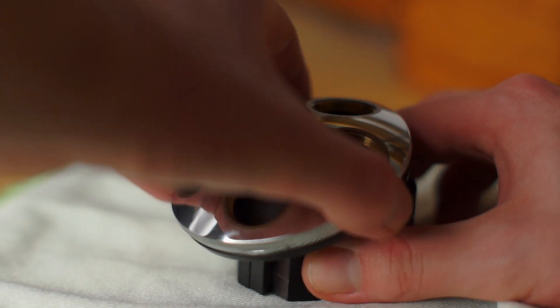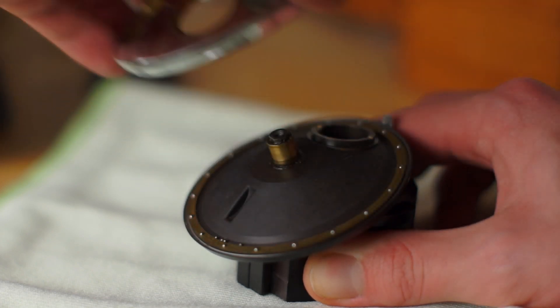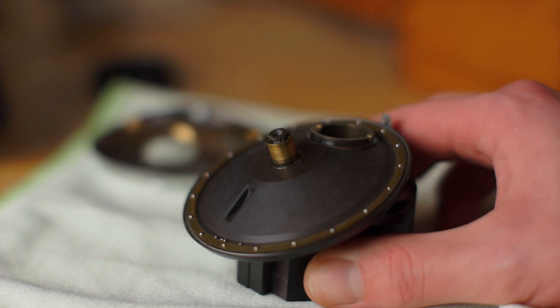After having removed the upper bearing, we can now remove the rotating element from the turret. This gives us access to the lower bearing.